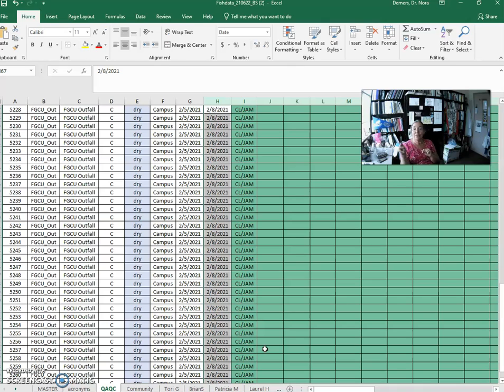So we lost track of the line and we put it in the wrong place. Not starting with anal fin number 3. Sometimes you'll learn to count back from 10. But you probably also want to take the very first anal fin ray that you see and call that one 3. And we're measuring 3 through 7.